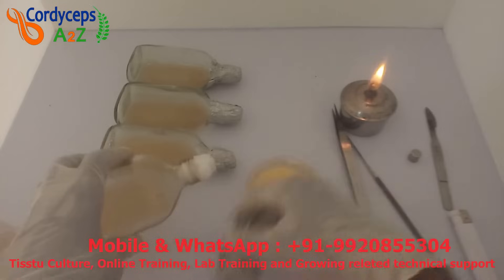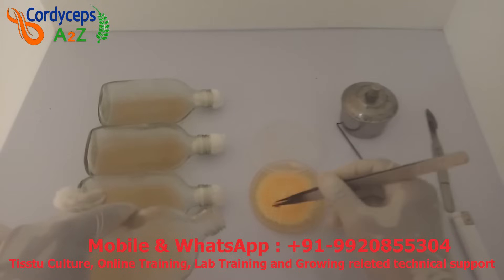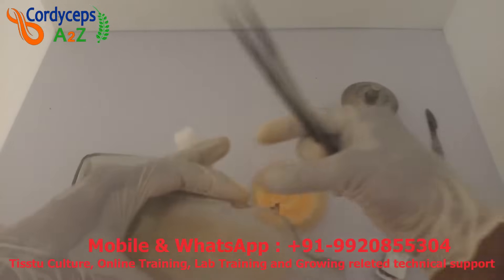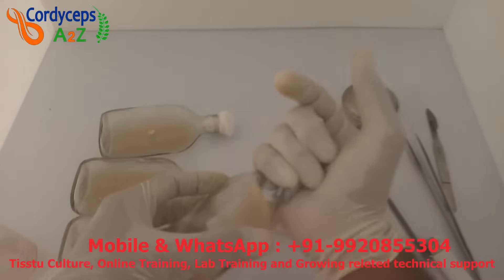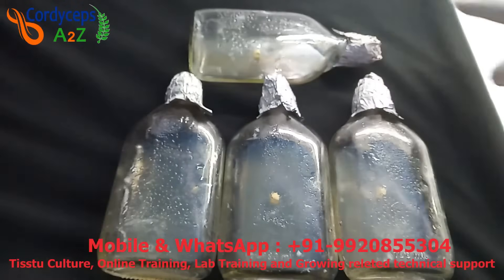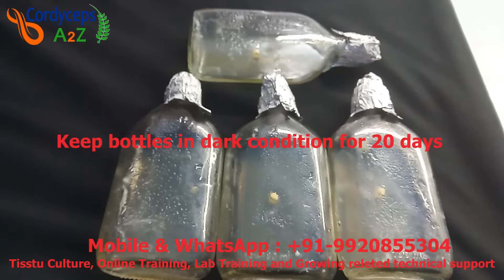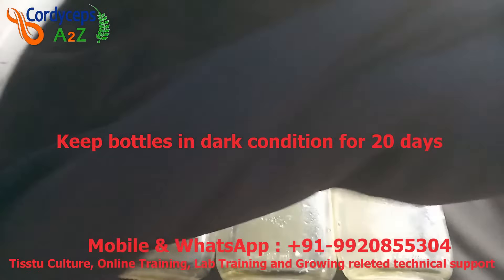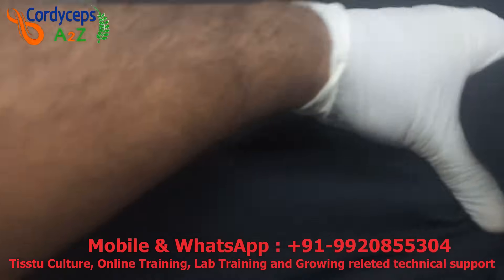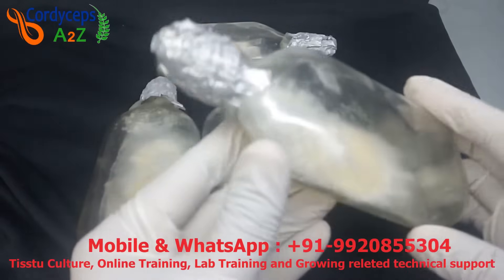Cut about half a square centimeter piece of tissue culture from the petri dish. Then remove the aluminum foil from the bottle, remove the cotton stopper, pick up the piece of tissue culture and place it in the center of the bottle. Put the cotton stopper back on and cover with aluminum foil again. Keep all these bottles in dark condition for a total of 20 days and maintain 20 degrees Celsius in the growing room. I am using a black cloth for dark condition — you can also use a black plastic sheet or turn off the light. After 20 days, you can see the culture has grown perfectly and is ready to use.